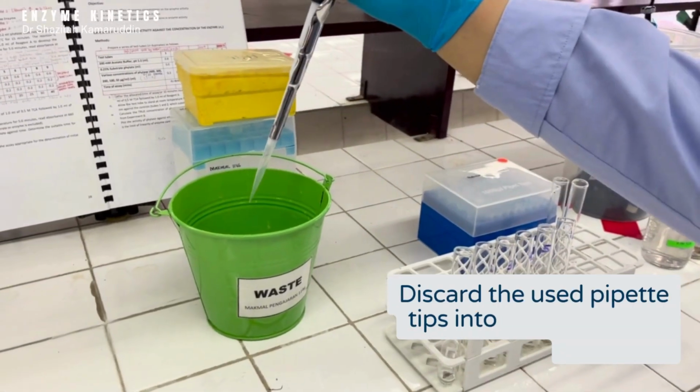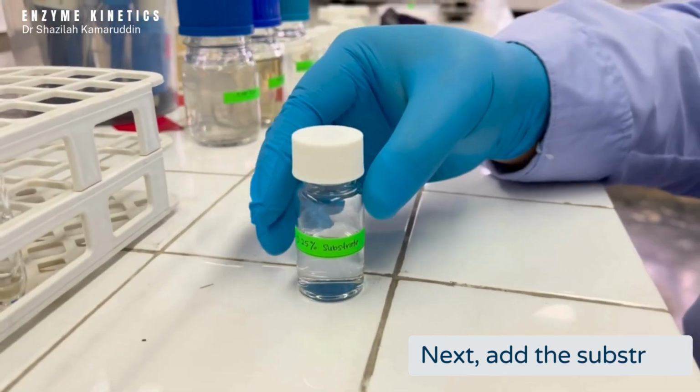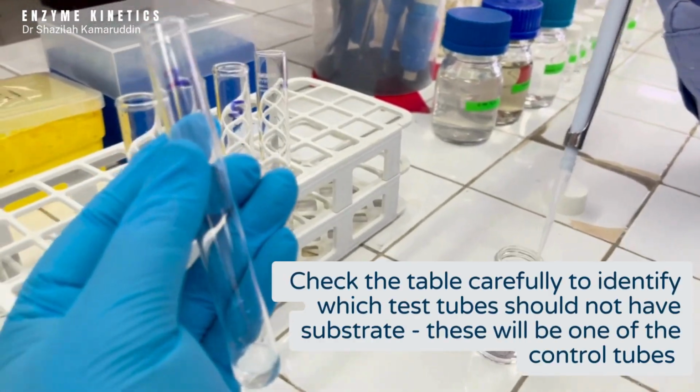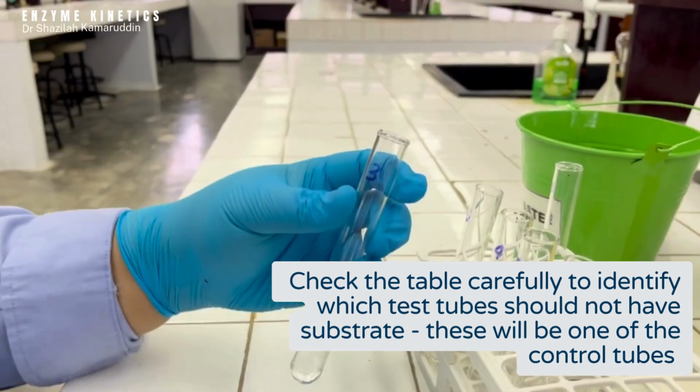Discard the used pipette tips into the designated waste bin. Next, add the substrate. Important: check the table carefully to identify which test tubes should not have substrate added. These will be one of your control tubes.